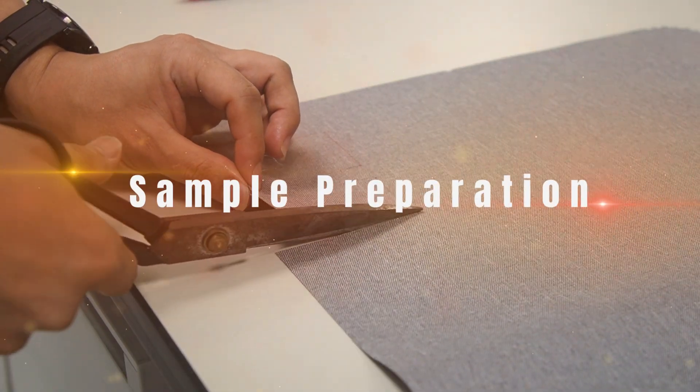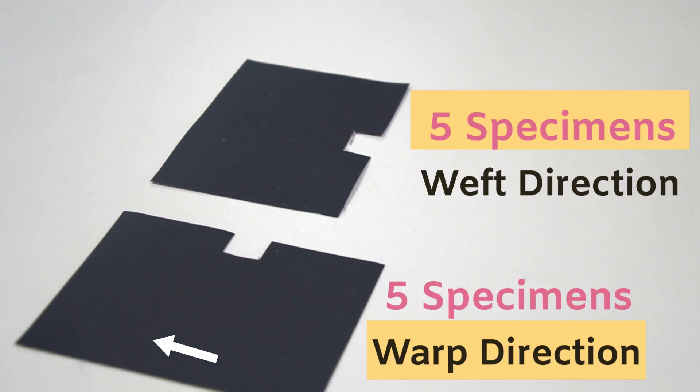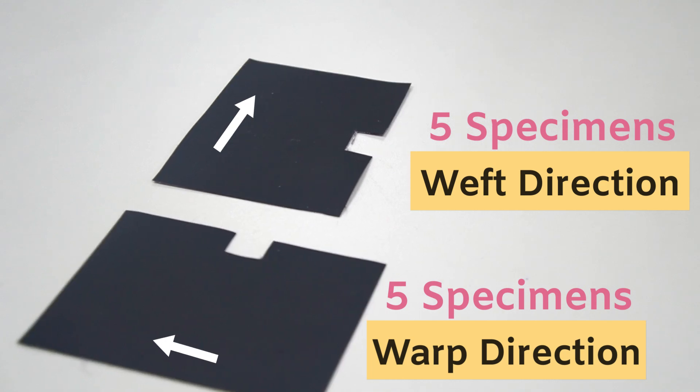First, let's prepare our fabric samples. We need five specimens cut in the length direction, also called the warp direction, and five in the width direction, known as the weft direction.